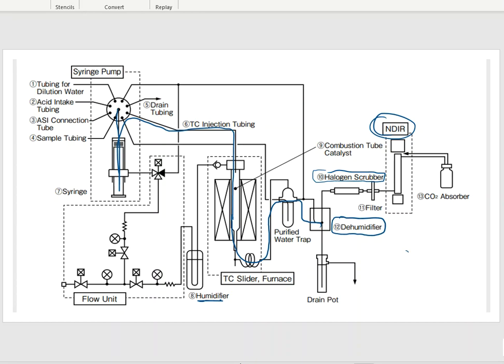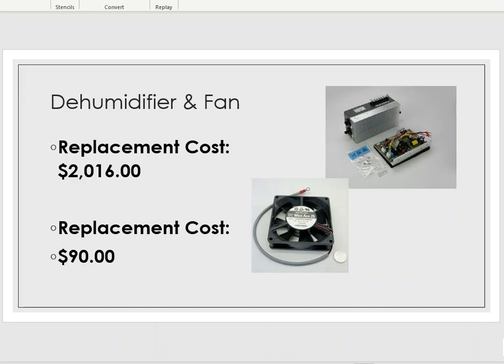All right, so there's got to be a reason, there's got to be a purpose in the dehumidifier. Why is it at the location that it's in? And not only that, but look at this. On this dehumidifier, there is a line that comes out from that box, and this line goes into what we call a drain pot. So we need to talk about the drain pot too. Right now is the perfect time to discuss that attachment as well and where to find that attachment. Okay, so let's take a look at the dehumidifier before we go into a little bit more detail.